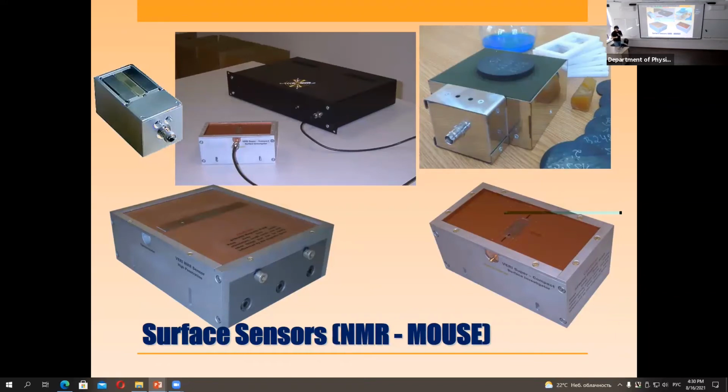The question about shielding is actually more important for this type of instrument. This used to be named the NMR mouse. Mouse can be abbreviated as movable universal surface explorer. This idea came to German professor Bernhard Blümich in Aachen in 2000, and he decided to build it.